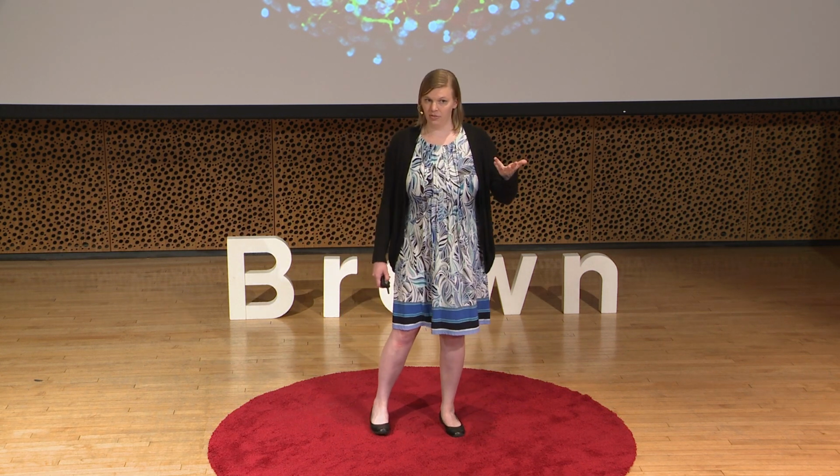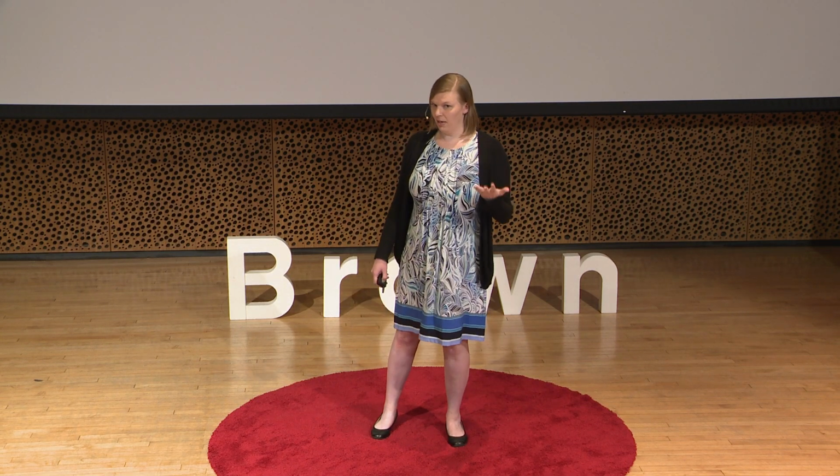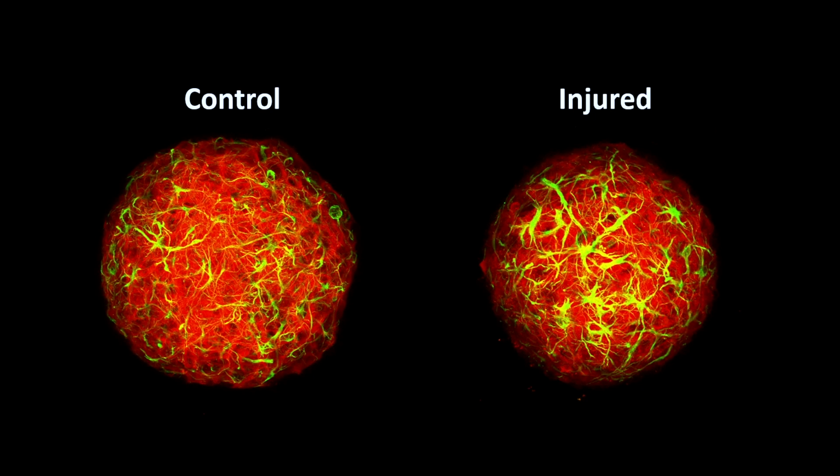An example of this is that I compare the morphology, or the cell structure, between a healthy control and an injured mini brain. As you can see above, in red are the neurons. In the control, we can see that they have a nice strand-like structure. This allows the neurons to communicate with one another. But after a stroke-like injury, this structure is disrupted, and so is the communication between cells.